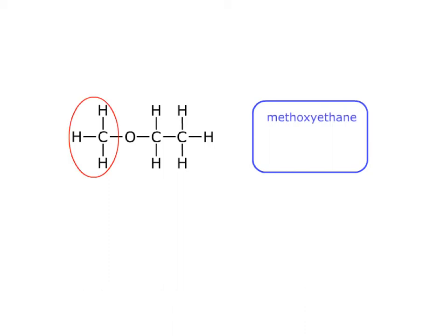So I'm looking there at the molecule. I can see I've got a group of equivalent hydrogens here. I've got another group here, and I've got a third group here. So therefore, in an NMR spectrum for this compound, I would expect 3 peaks. Now, I want information about the area under these 3 peaks. The integration trace simplified down, well, it's caused by 3 hydrogens, 2 hydrogens and 3 hydrogens. So the peaks will be in the ratio 3 to 2 to 3.